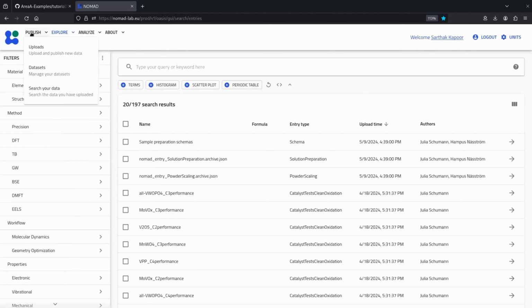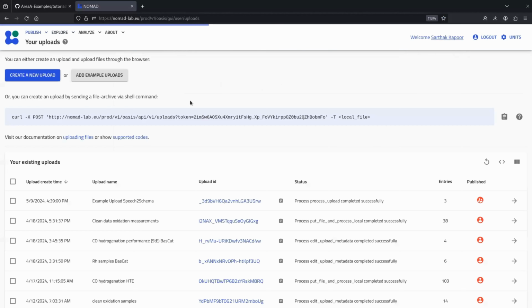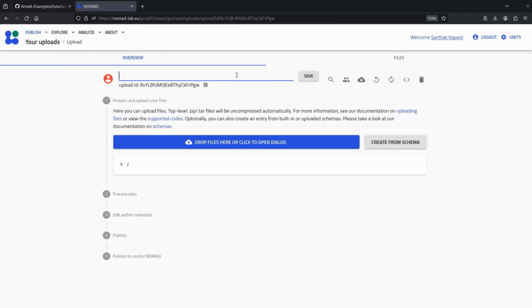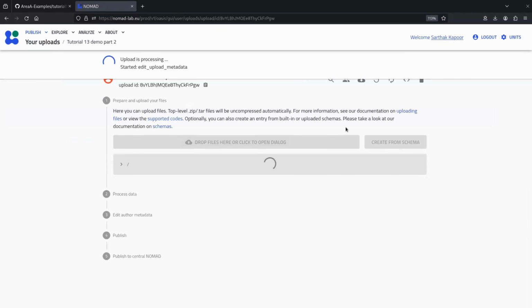And to do that, we'll go into the publish and we'll select the upload here. And then we can create an upload, and maybe we start with naming it something. Let's say tutorial 13 demo part 2, and we hit save.